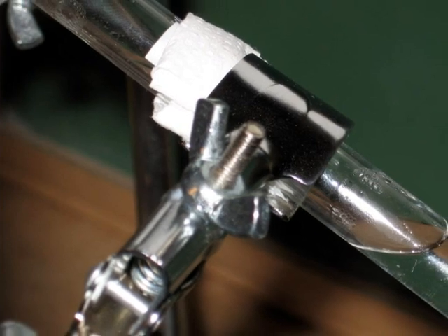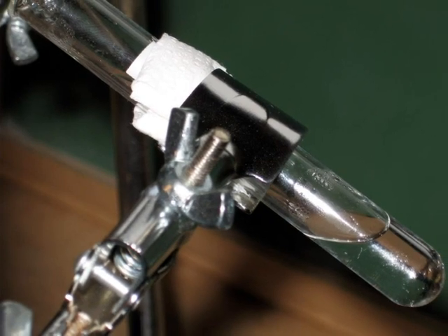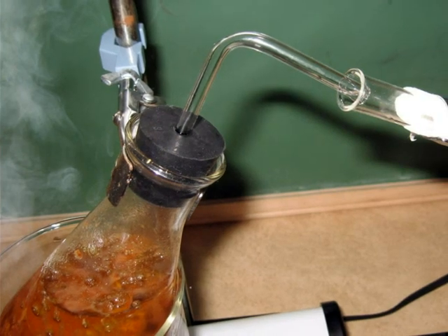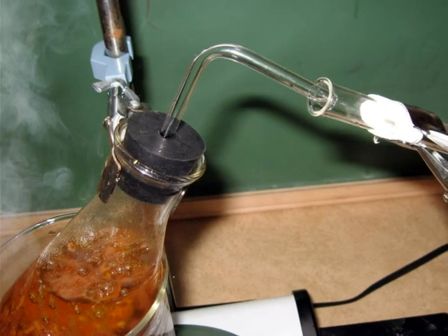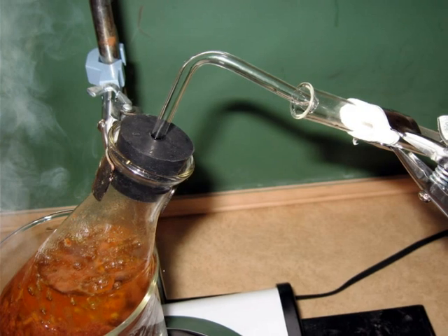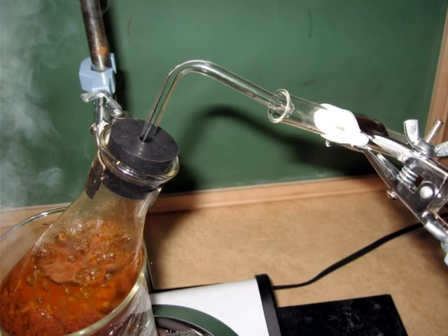In this experiment, the alcohol is the carrier for the essential oil, so at the bottom of the test tube you'll have an alcohol and essential oil mixture. It may take a few minutes for your alcohol to boil. If you see boiling occurring inside your flask, that is a sign that the alcohol is changing from the liquid state into a gas vapor mixture.